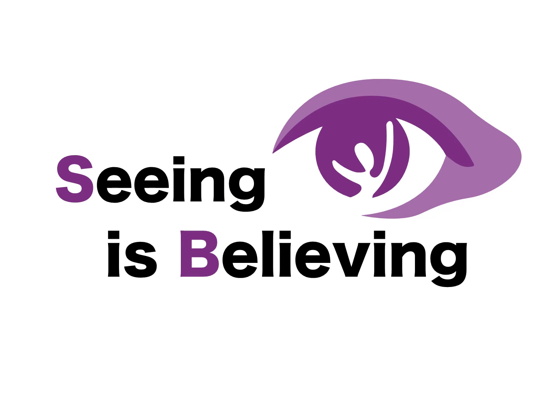Seeing is believing. This is the key phrase for the MSI team. From long ago, researchers have wanted to see what we cannot see using new technologies. As the saying goes, seeing is believing. Visual information is intuitively understandable compared to complicated numerical information.